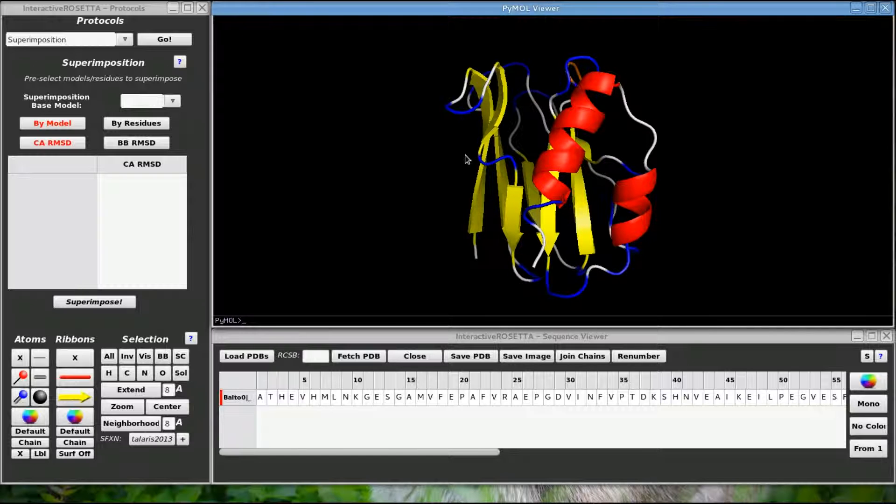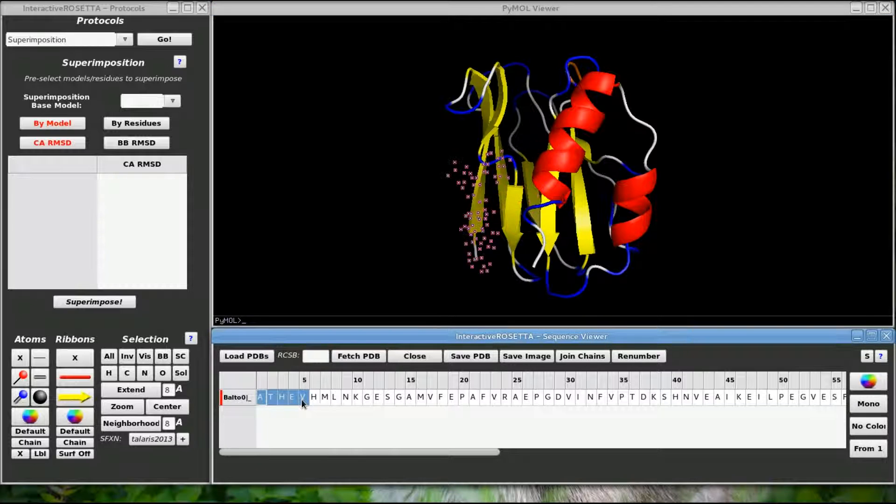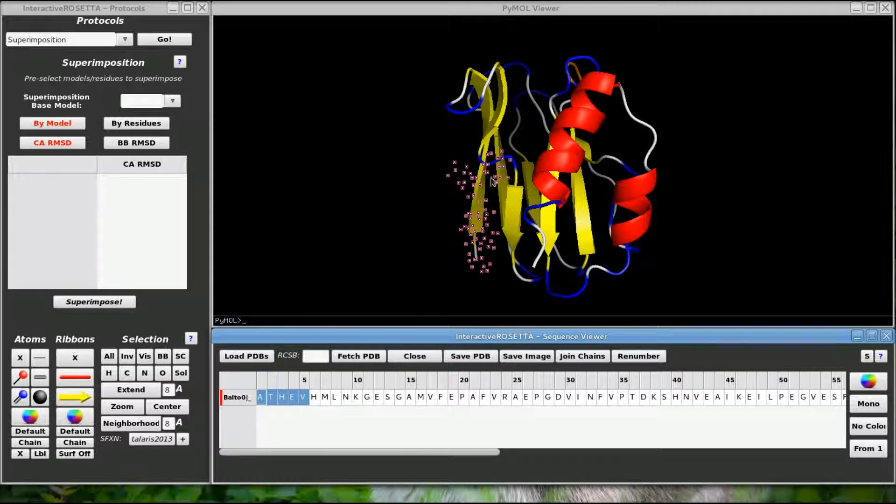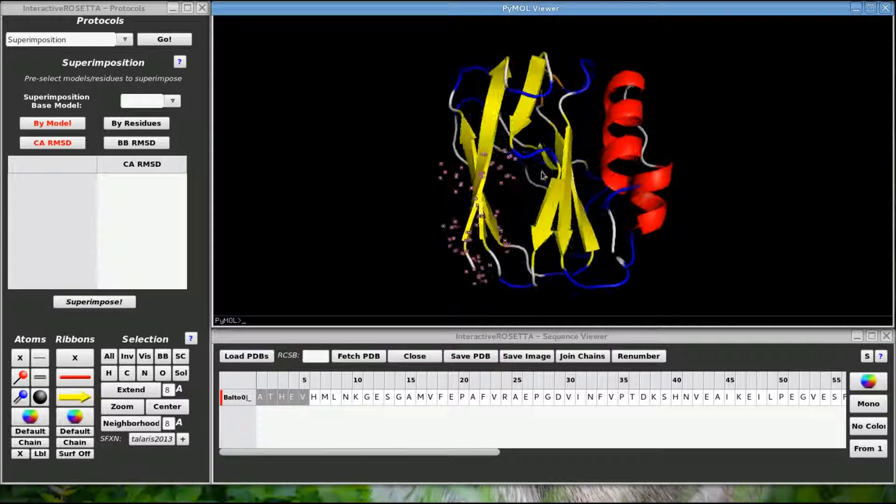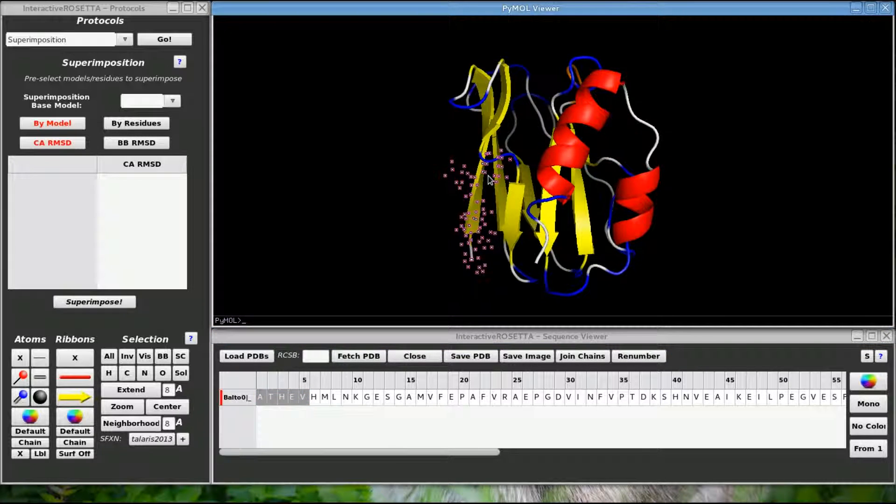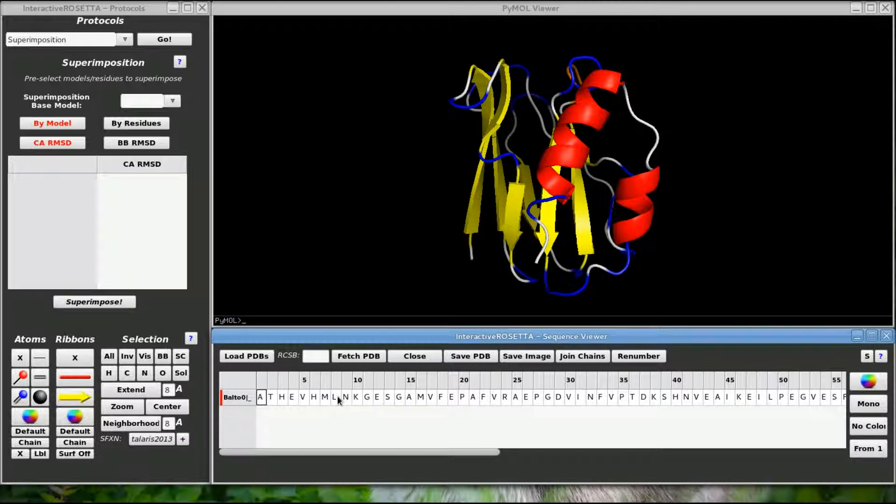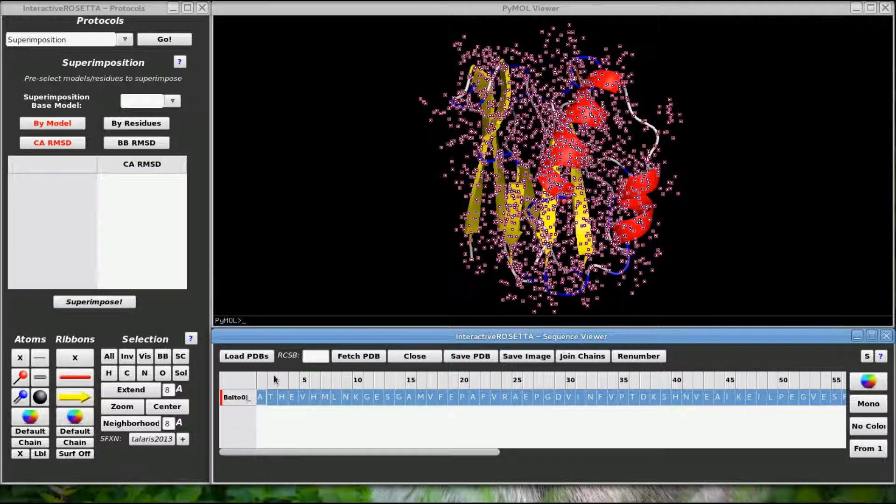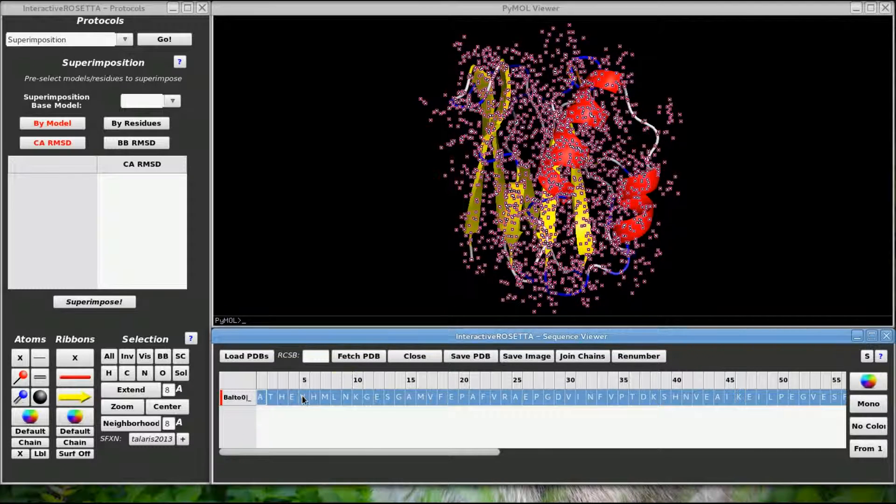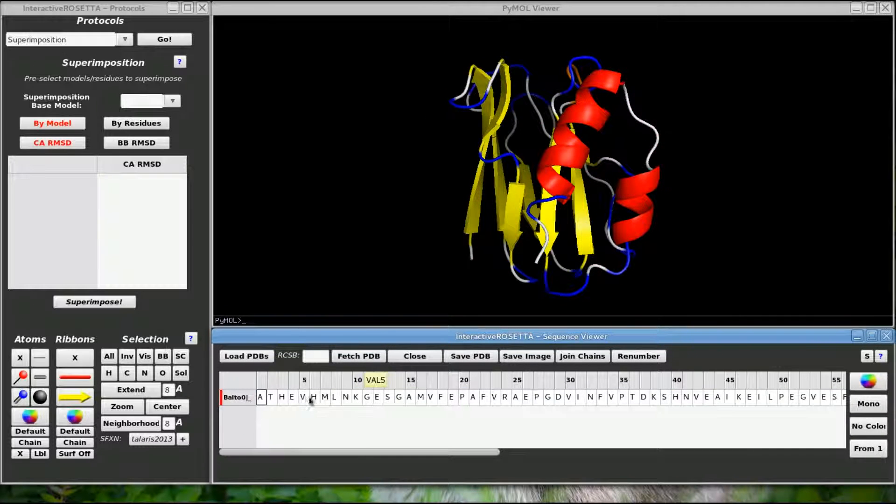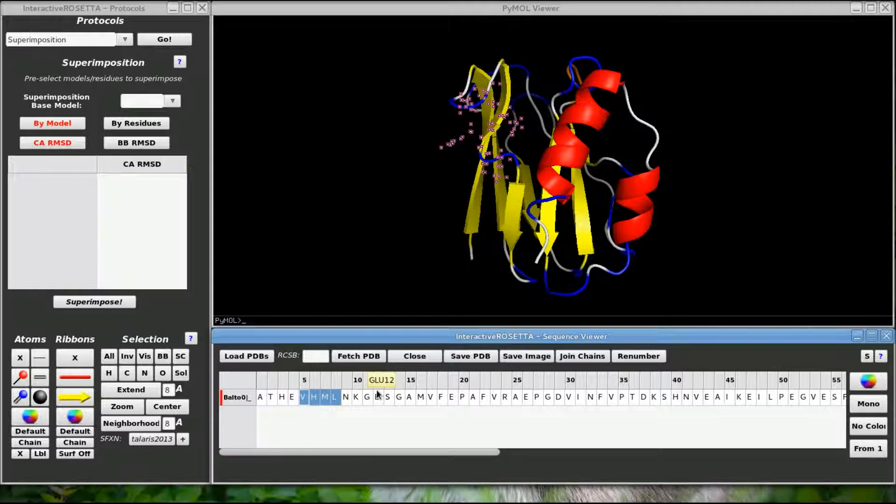The primary sequence down here is selectable. When I select a certain region of the sequence, the corresponding residues in the structure become selected. Right clicking unselects everything. Double clicking on a row or column label will select everything in that row or column. If you want to select discontinuous segments of the sequence, you need to hold down the control key while selecting.